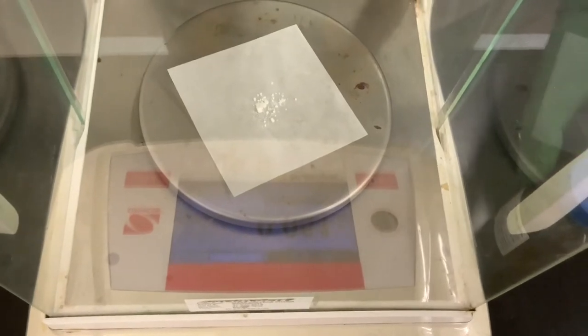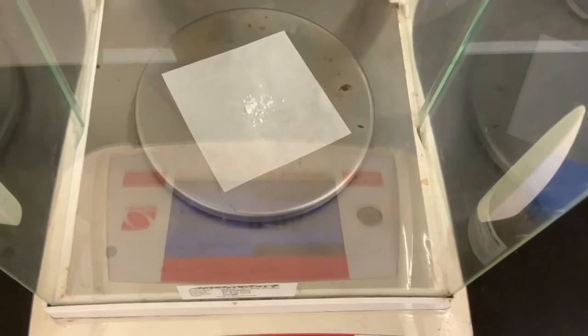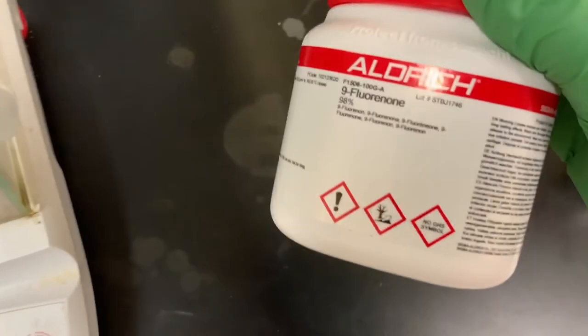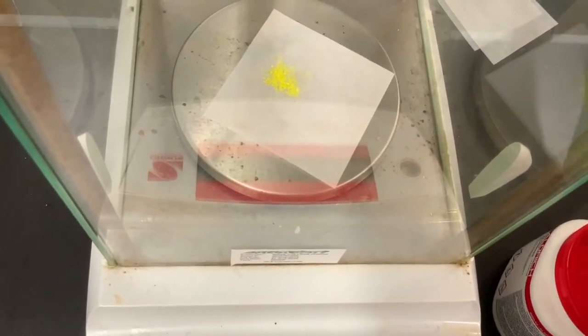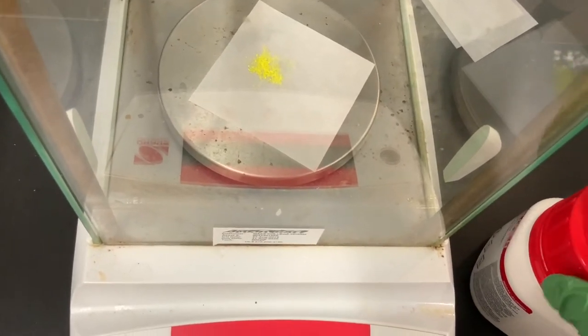And so we're going to be dealing with that white solid, and we're going to combine it in a culture tube. In the same culture tube, then we're going to combine the other 2 organic solids. We're starting with 56 milligrams of 9-fluorenone, sold from Sigma Aldrich, and we see that this is the first organic solid that has a color to it, right? It's sort of like a canary yellow type color.